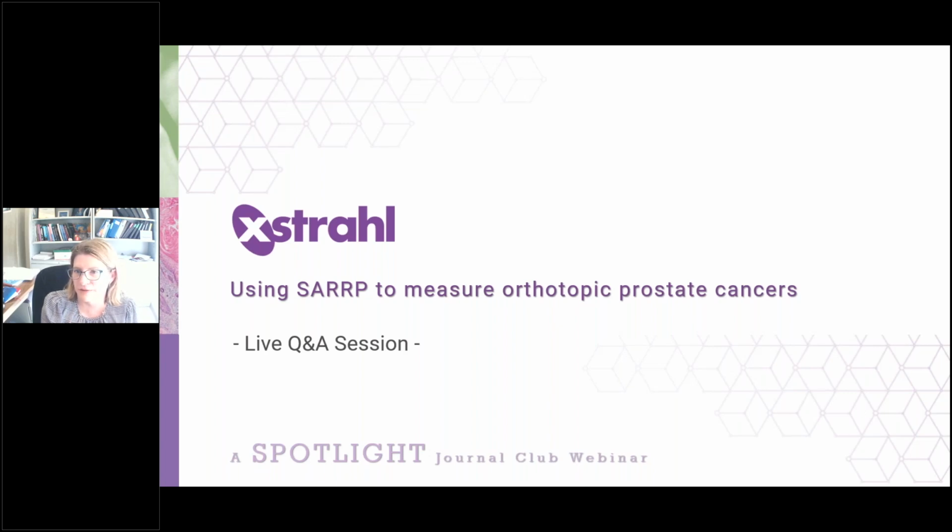There isn't a lot of fibrosis in these tumors either. So that I can tell you just histologically, but I did not correlate that with our imaging or with the IVIS. So I can't comment specifically on the experiments that we did, but I can tell you that we've done histology on these tumors in the past, and that's what we have observed. So there could be some of that going on, but I don't think that accounts for everything that we're seeing in these discrepancies.